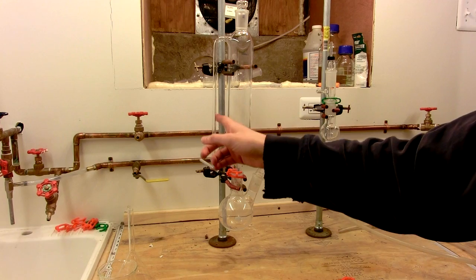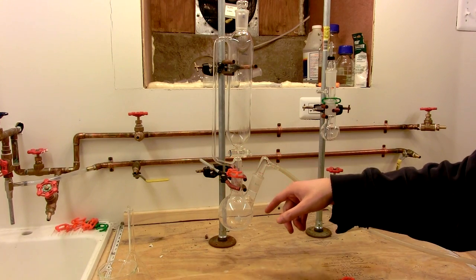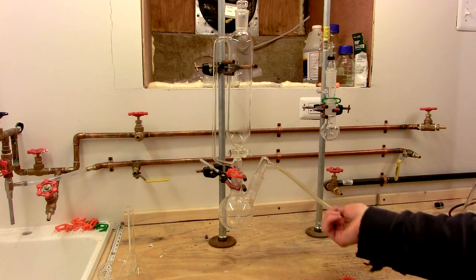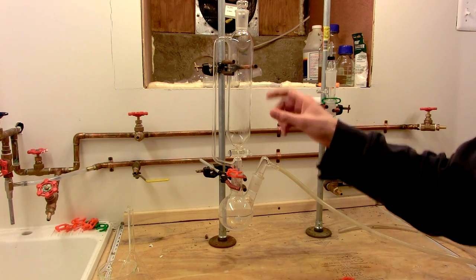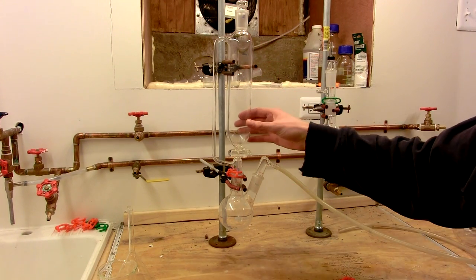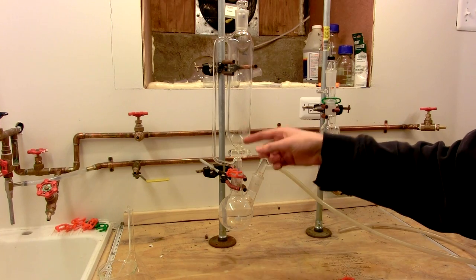It's important that you have a pressure equalizing addition funnel because the pressure generated by the chlorine gas being delivered to the experiment could exceed the pressure in the headspace above the hydrochloric acid in the addition funnel, which would cause bubbling up through the stopcock.